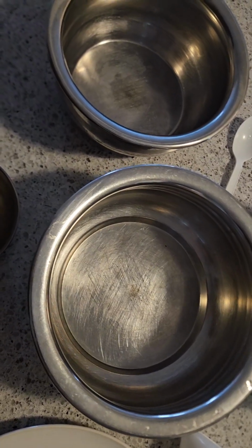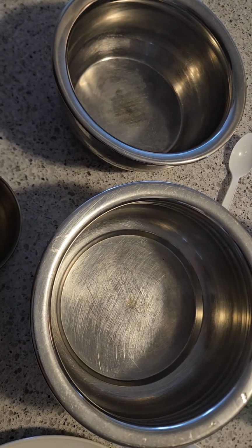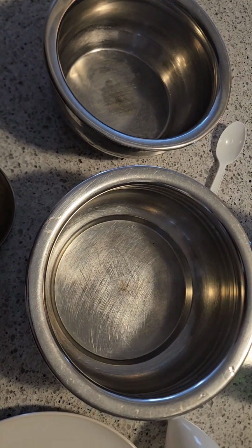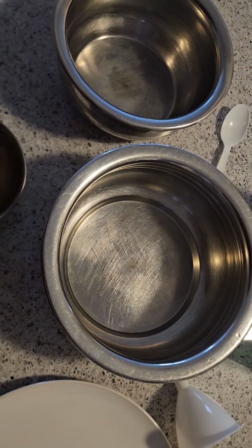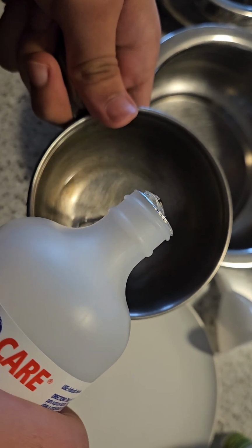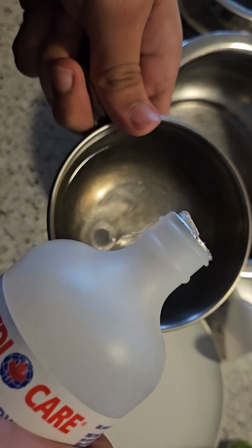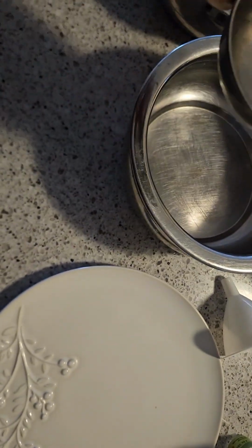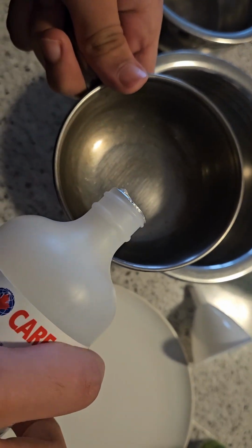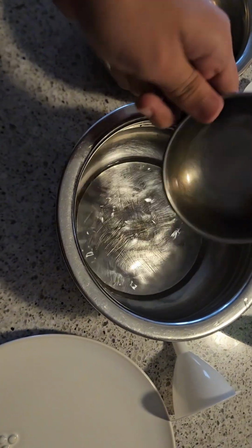Okay, so for my pre-observation, I'm going to create a mixture with a higher concentration of alcohol using a 3 to 1 ratio of alcohol to aloe vera gel. This mixture has an approximate alcohol concentration of 74%, which is within the recommended range for effective hand sanitation. I'll repeat it 3 times. And then one more.